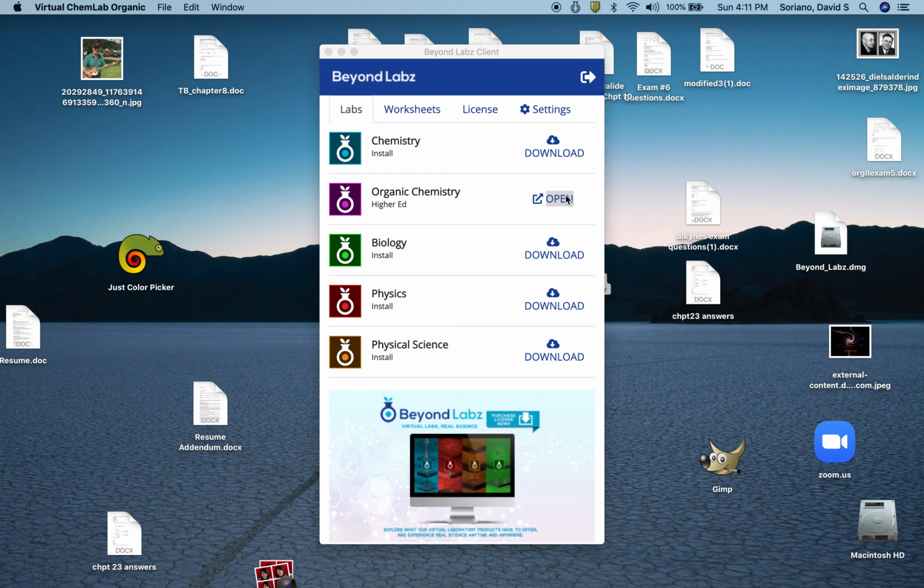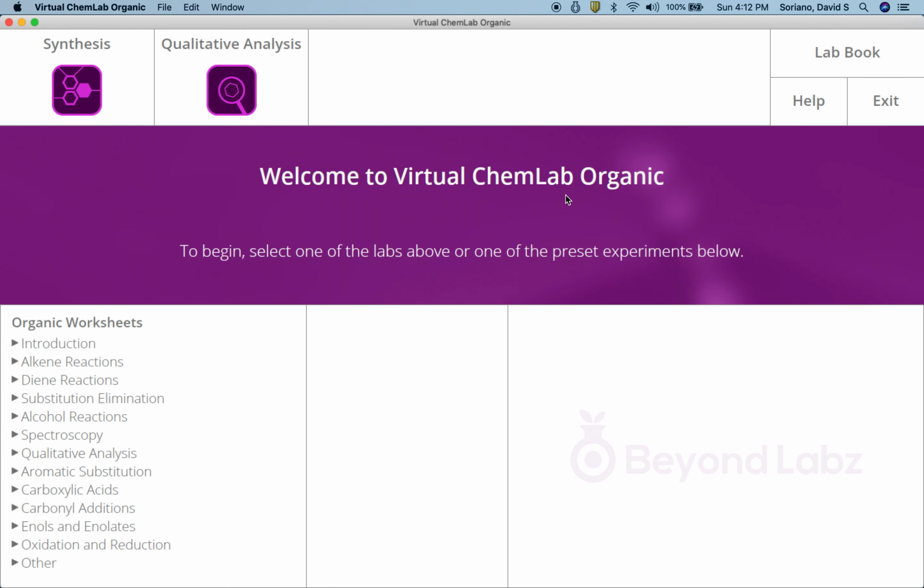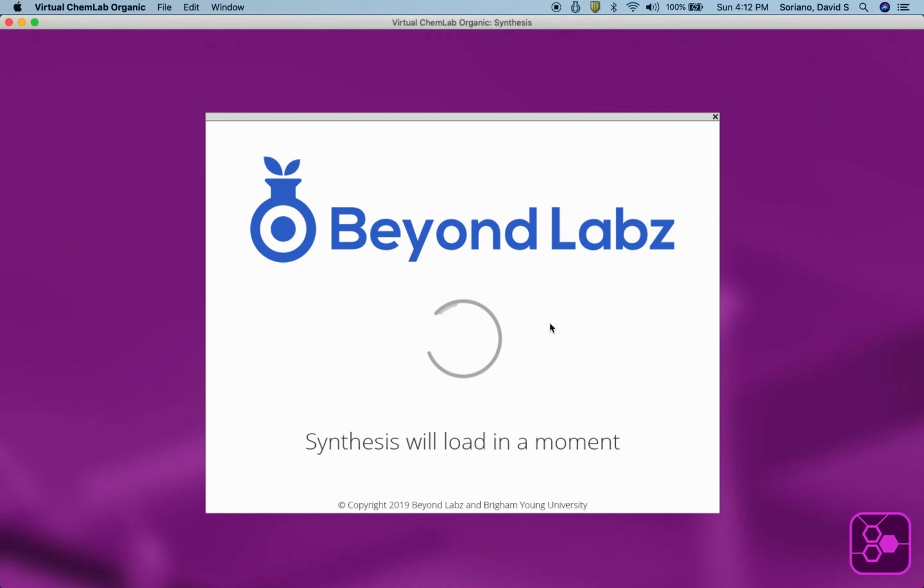YouTubers, I'm back again with video number 5, and this is another look at the Diels-Alder cycloaddition. In the prior video, I showed you a particular workup after the reaction is complete. Now we want to look at a different approach, because the product of the reaction we're doing is a solid at room temperature.